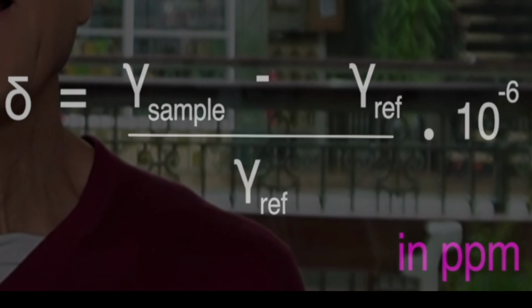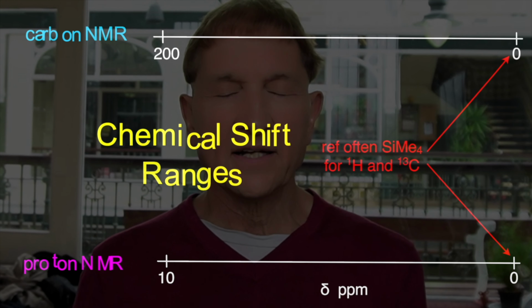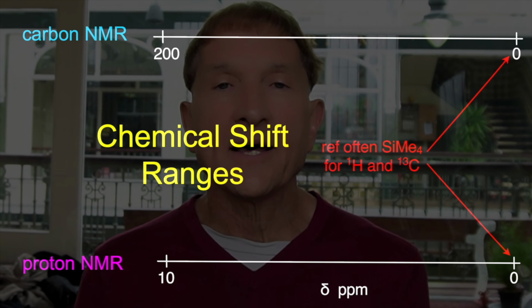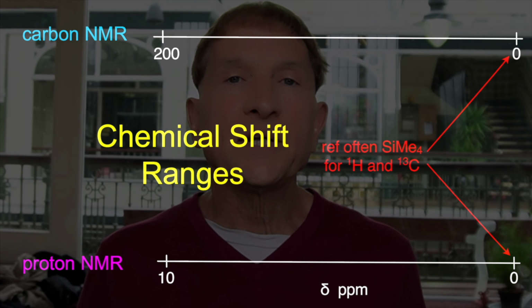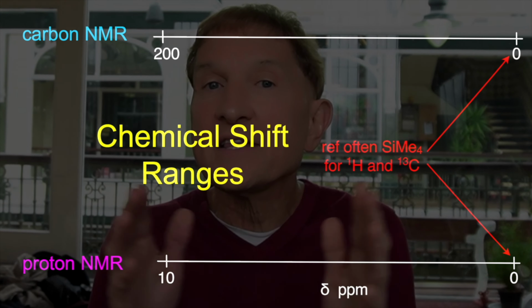For C13 NMR, the chemical shifts where most nuclei resonate is between 0 and about 210 ppm. For protons, it's much less. It's between 0 and 10 ppm. So we say that carbon NMR has a much higher dispersion than proton NMR. It's easier to see the peaks apart.